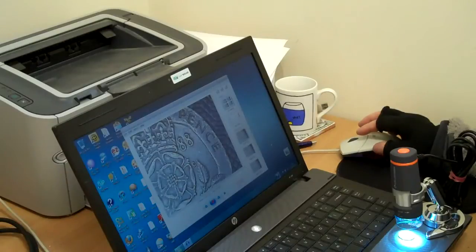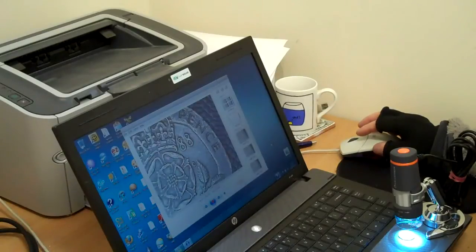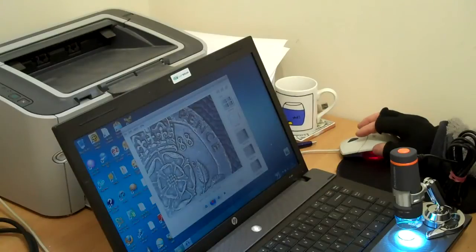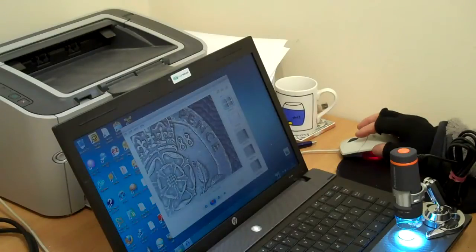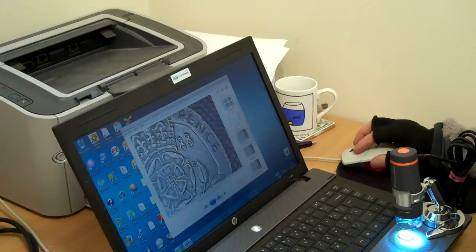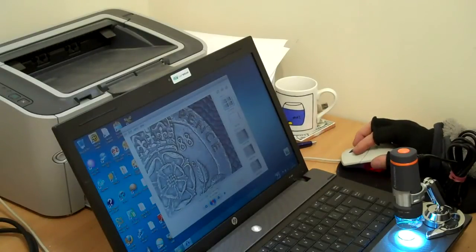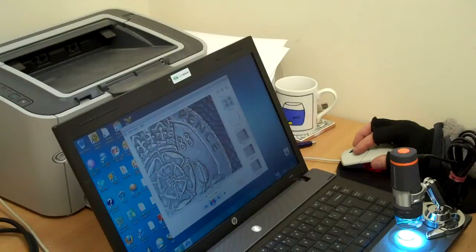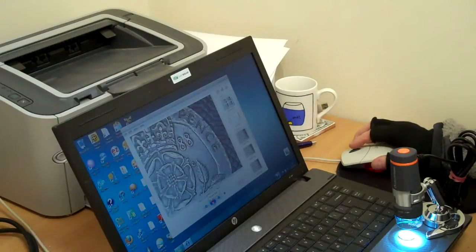I imagine that's for maybe insects or something that you might be looking at, something that's changing. Also, you can make a movie, which is a little video. Which is also going to be pretty good for insects, I would have thought.